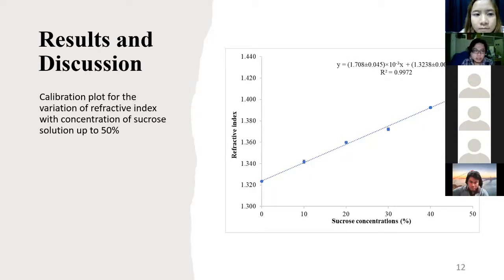Dr. Sojit, did you ask him about the resolution of his research already? Yeah, I have asked. Yes, it's about the sensitivity of this detection, because he didn't show any sensitivity. But in this method we prepare the unknown solution for use in the equation, and we prepare the 25 concentration weight by weight, and we obtain the value 24.65, and this is not shown in this presentation. This is my error from the linear fit.